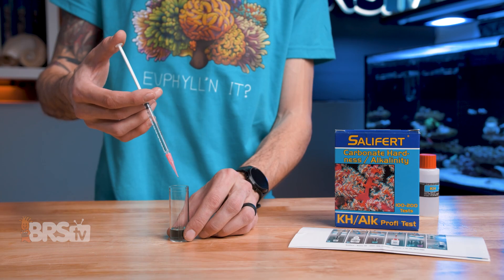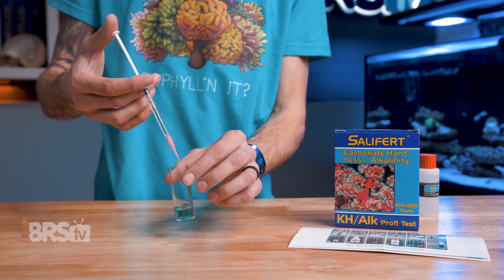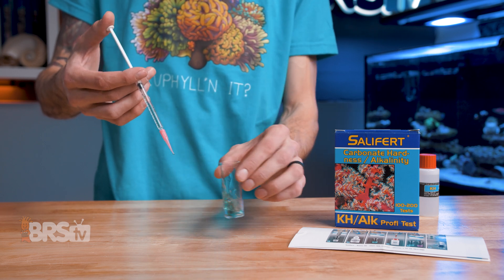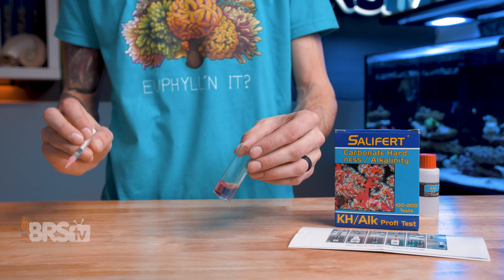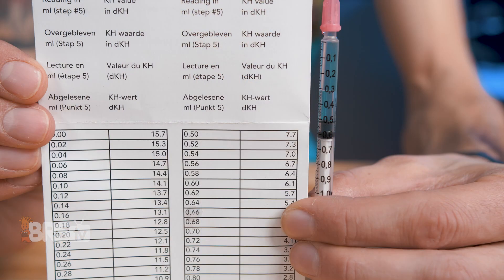Now we're ready to start titrating. Add a single drop of reagent KH to the vial, and then gently swirl for one to two seconds. Repeat this until the liquid in the vial changes from the blue start color to the pink end color that's shown on the quick reference guide. Once the vial changes over fully to that pink color, take note of the remaining amount of liquid in the syringe and compare that amount to the chart in the instructions to get your alkalinity reading.